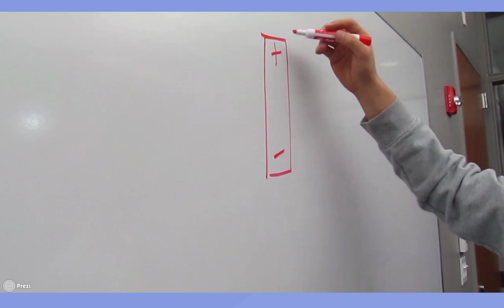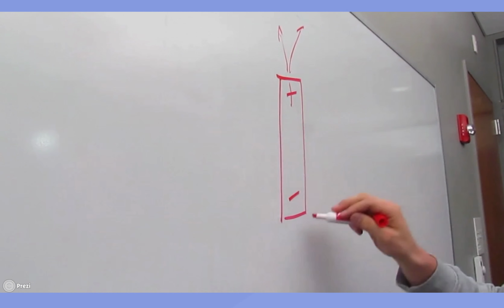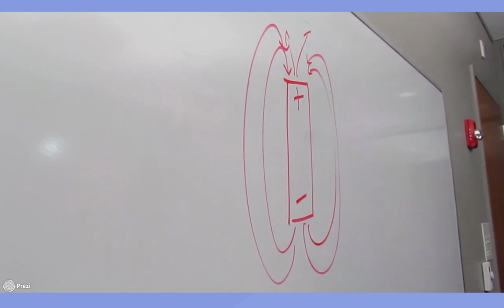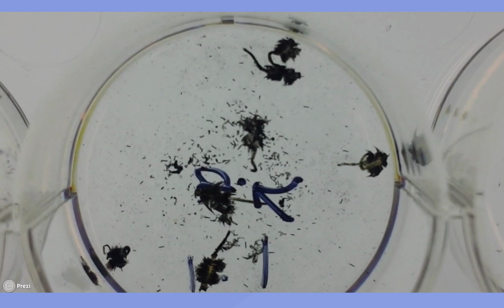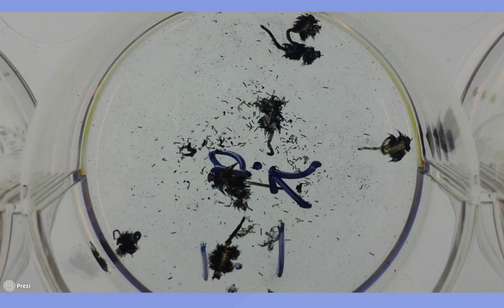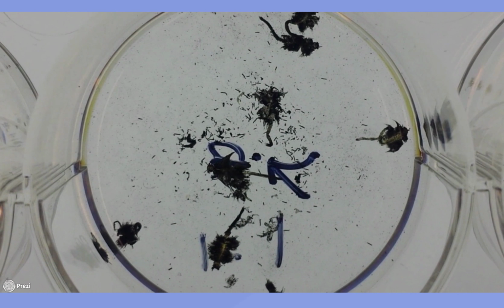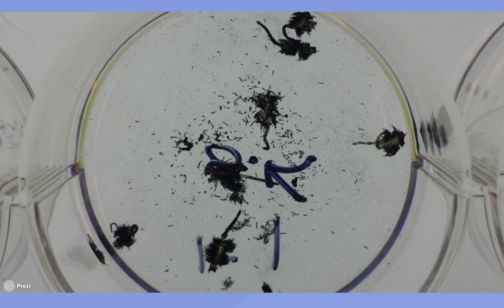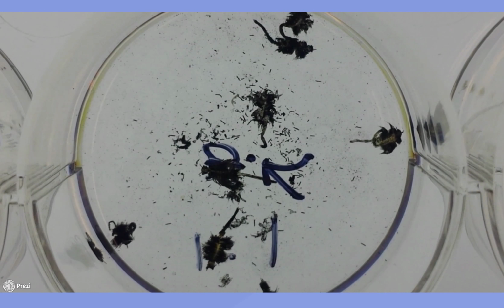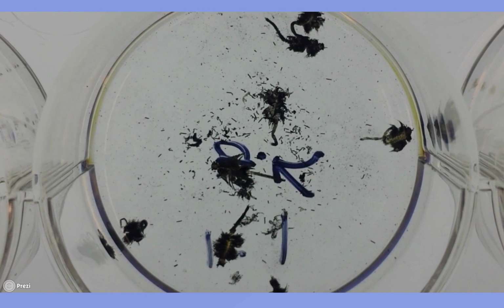The effect of doubling the 0.4 concentration of the nanoparticles to 0.8 will double the magnetic strength. The lethal dosage calculated by the biology group revealed that the 0.8 variation of the nanoparticle killed 100% of the brine shrimp population, with only 1 milliliter of nanoparticle mixed with 1 milliliter of seawater. The best contrast agent would be the 0.4 concentration of the nanoparticle, because it requires the least dilution of the solution for it to be considered safe. The most toxic variation will be the 0.8 solution, because it needs to be the most diluted for it to be considered safe.